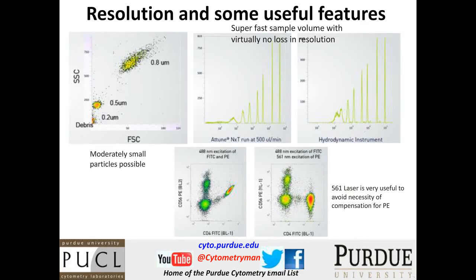So a few features that I mentioned earlier: reasonably good dimensionality in looking at small particles. It has the capacity to use the 405 nanometer laser for scatter. And of course, because you reduce the wavelength of the laser to 405, you increase the resolution. So that's a nice feature.